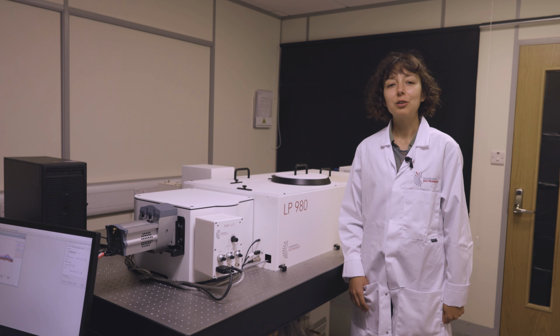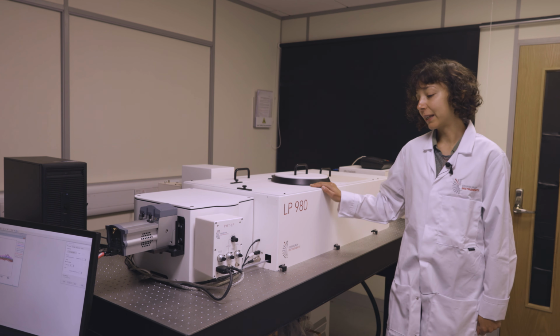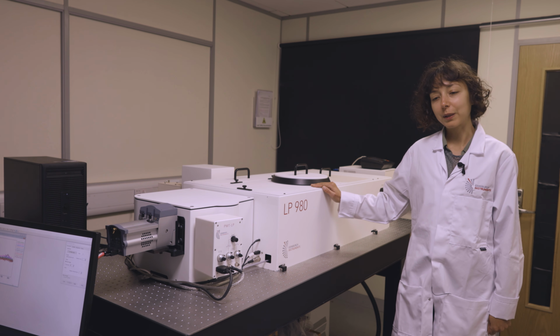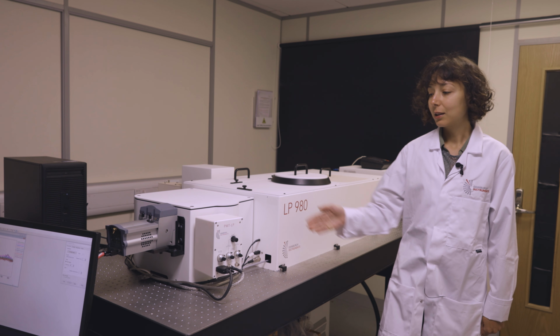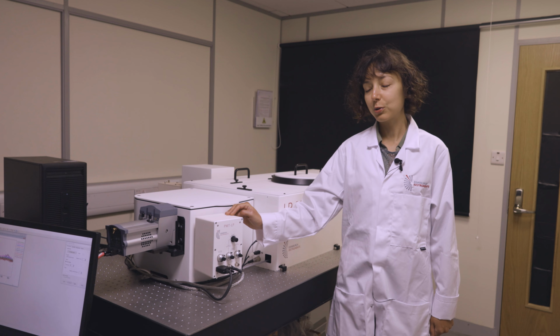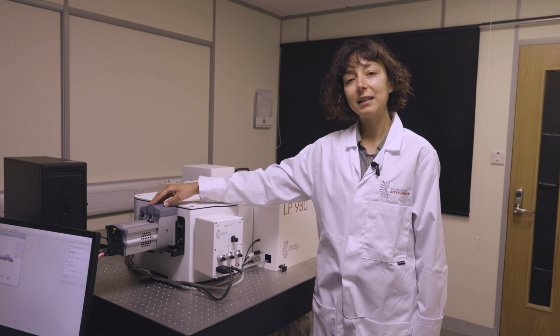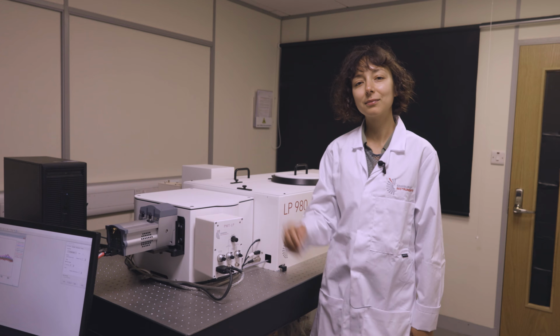In this video, we will show you how to acquire rapid transient absorption spectra using the LP980's multi-channel detector. The LP980 is our transient absorption spectrometer, and in this case is configured with two detectors: a photomultiplier tube for kinetic single-channel acquisition and an ICCD camera for multi-channel spectral acquisition.